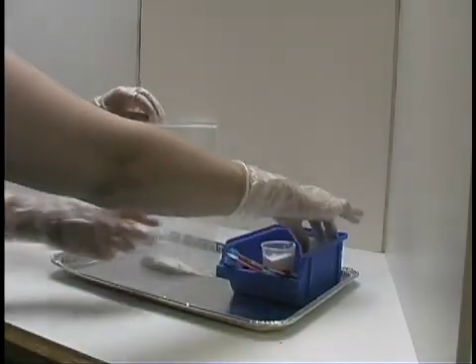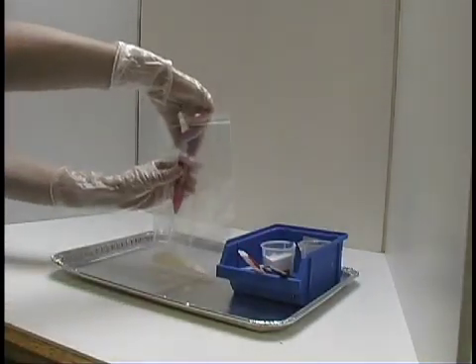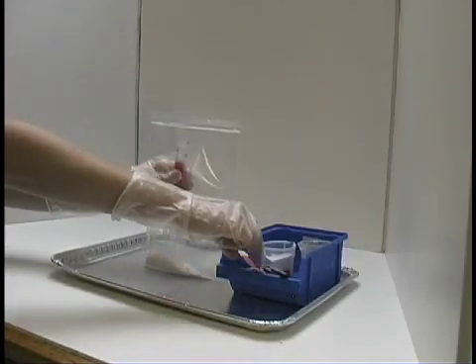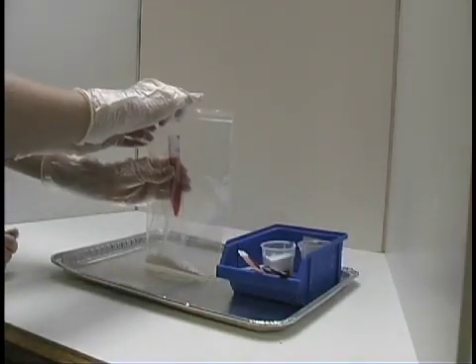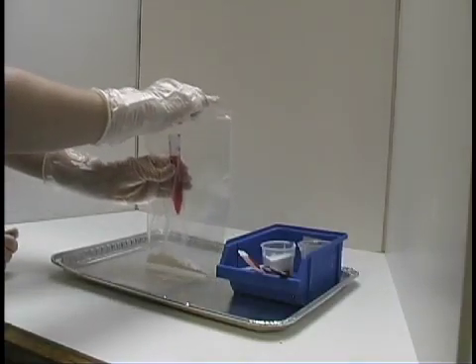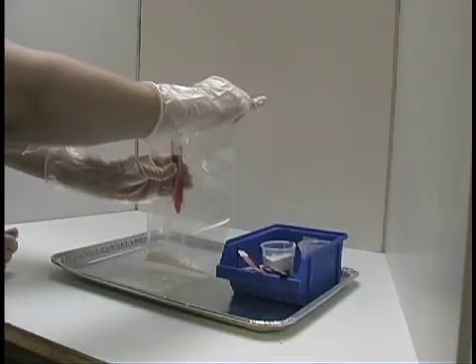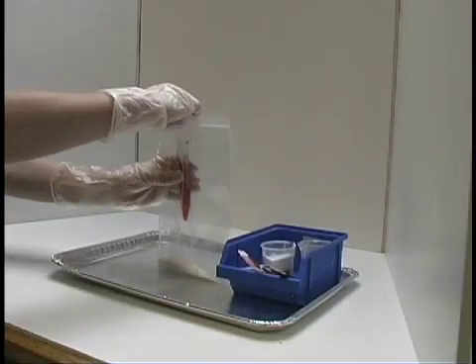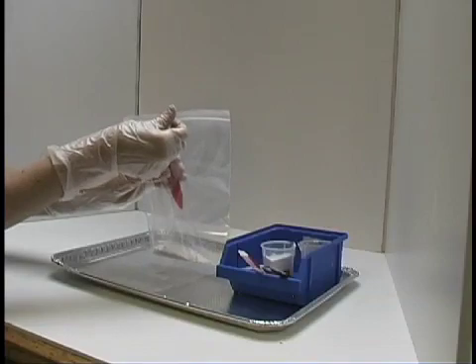Then, put a closed tube of phenol red in the bag, and remove the top while it is still pointed upwards. While one partner holds the bag and the tube, the other partner seals the bag tightly. Make sure to check the seal very carefully.